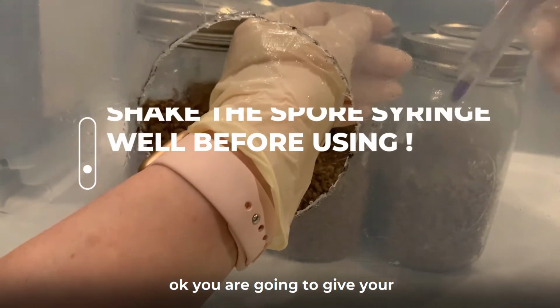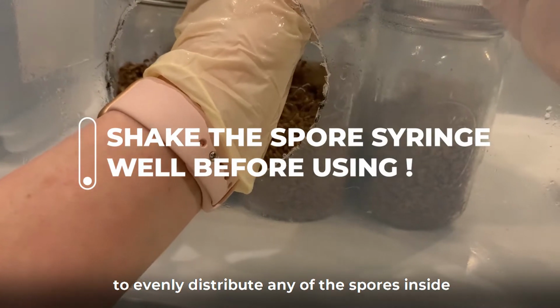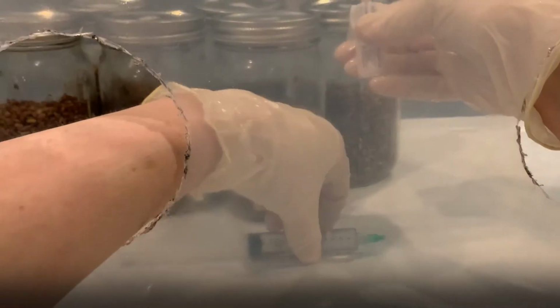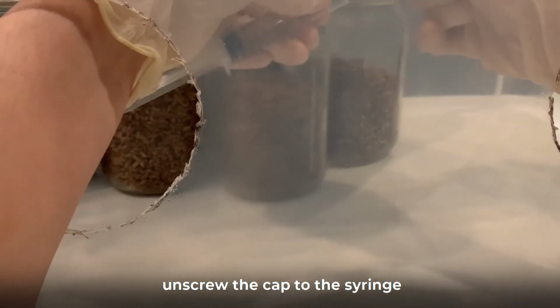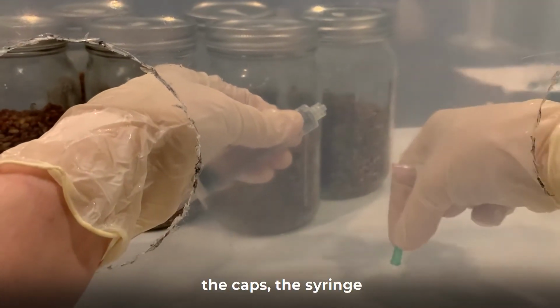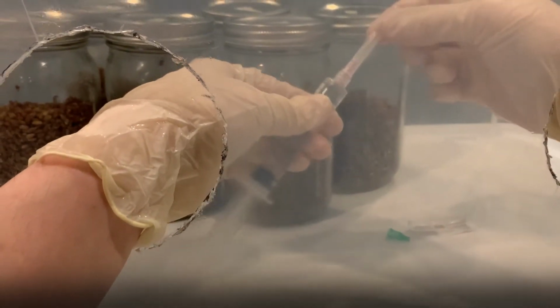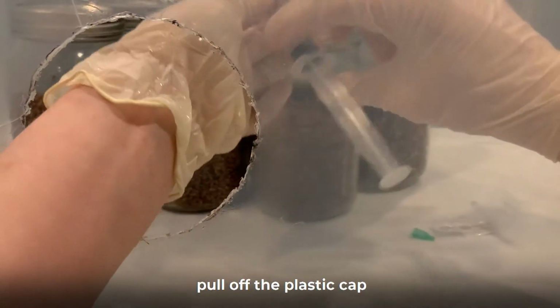Okay, you want to give your syringe a good shake to evenly distribute any of the spores inside. So to get started, I'm going to open up the needle package part way, and I'm going to unscrew the cap to the syringe. Make sure that everyone can see. Pull off the cap to the syringe and screw on the needle. Pull off the paper and pull off the plastic cap.